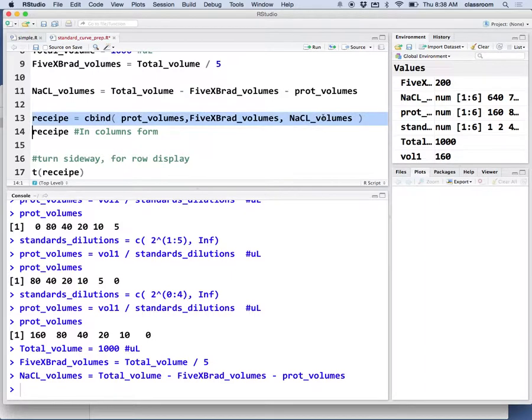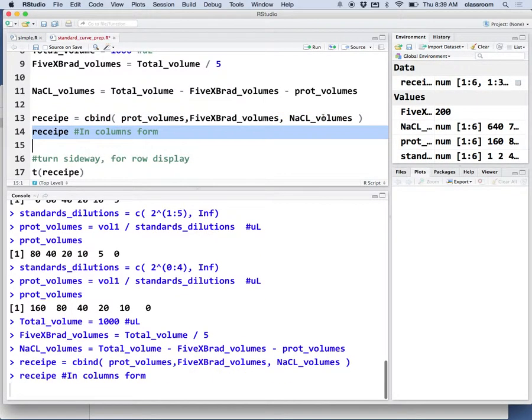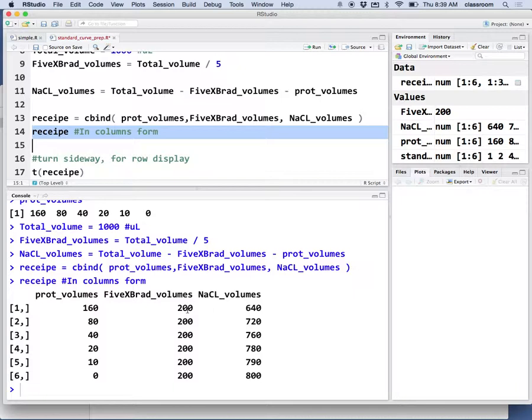The cbind command collects all this information and puts it together. Then I show the recipe. The first tube has 160, Bradford 200, and sodium chloride 640. That's the recipe.